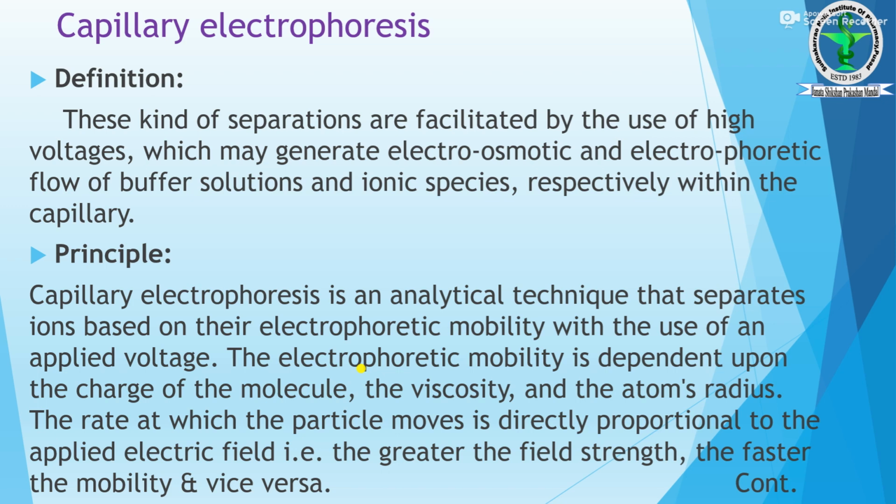Remember these two words, which are generated by electroosmotic and electrophoretic flow of buffer solution and ionic species respectively within the capillary. But all of this happens inside the capillary. So there is a separation facilitated by the use of high voltage.